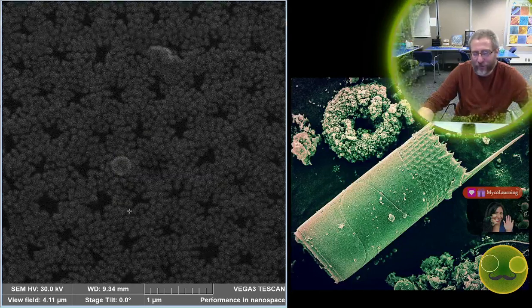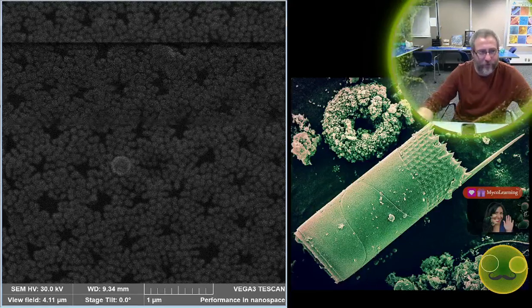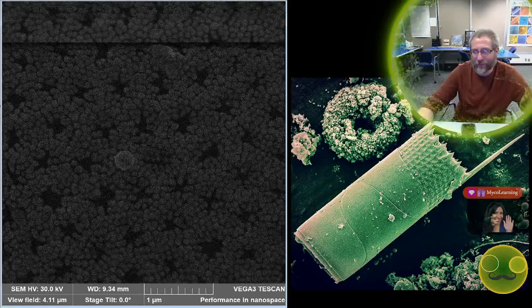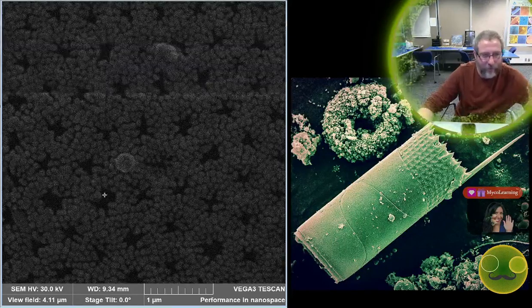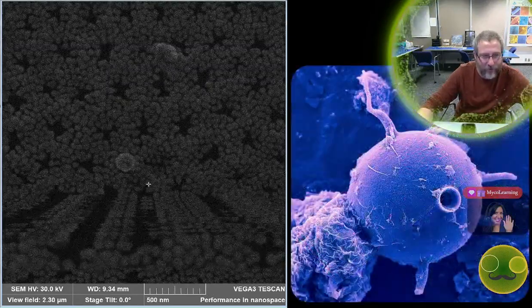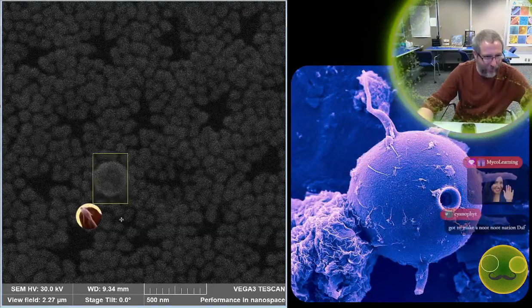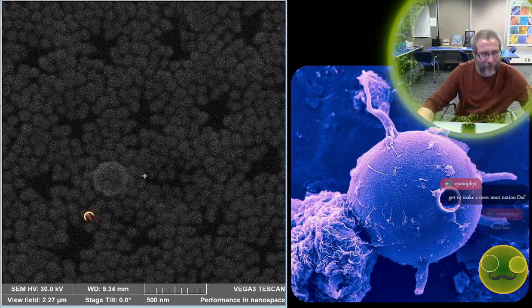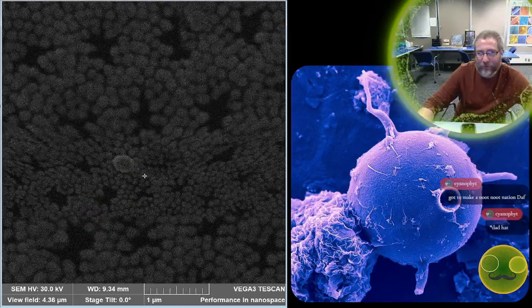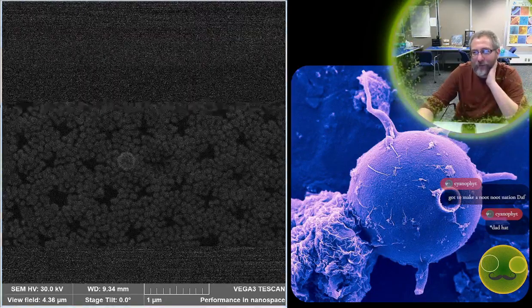And I think if I want to get any closer, because we're down to kind of 1 micron zone, I would have to go to a 5 or a 6 on the beam intensity, which would increase the resolution a little bit. But I think what I'm going to do is just zoom in, try to get the focus as clean as I can, which I think is right about there, and then zoom out a bit. Oh, I know what I can do. One more thing I can do, which is get us a little closer.